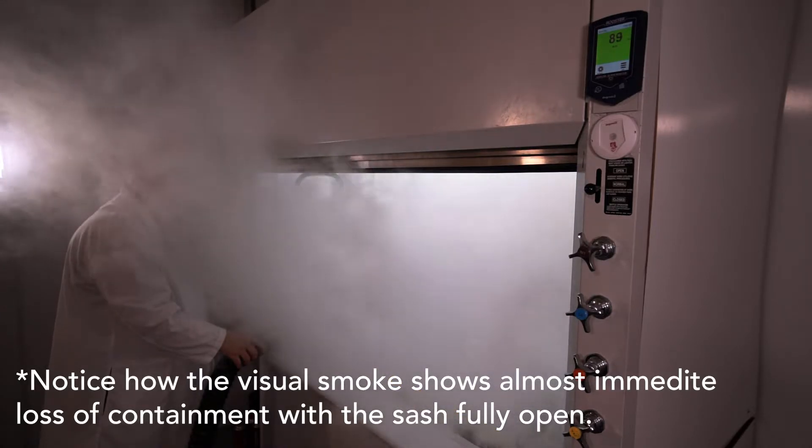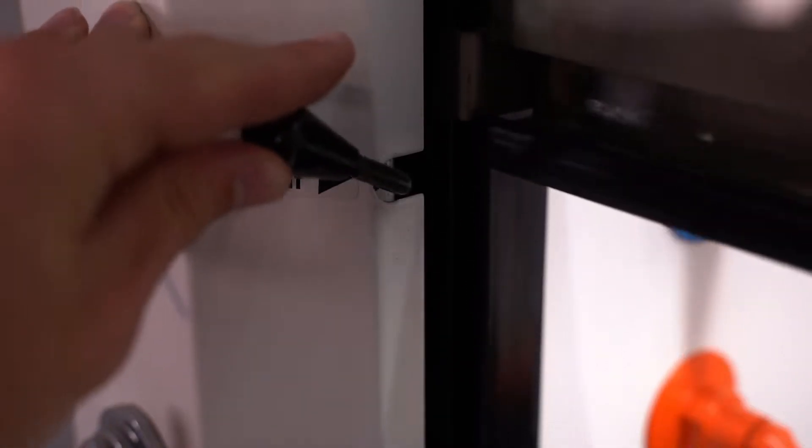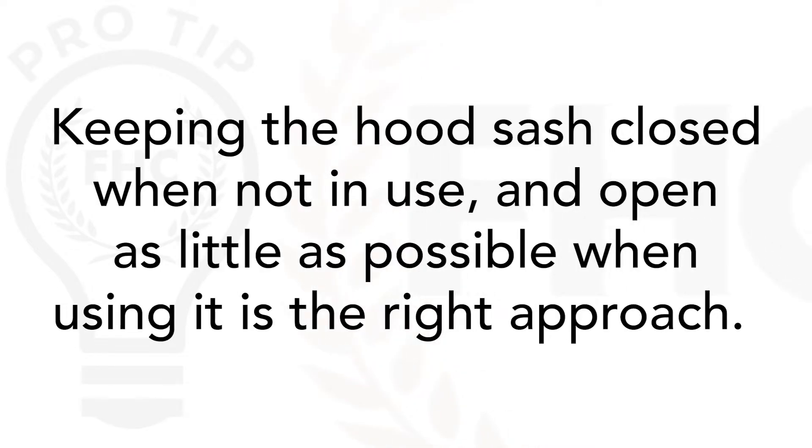Lowering the sash is better. Sash movement should be easy — many sashes can be operated with one hand from any position along the sash handle, and many newer hoods have auto sashes that move with the assistance of a motor. Hood sashes are generally made from some type of safety glass, either tempered or laminated, to offer more protection and minimize the likelihood of the sash itself breaking and becoming part of an incident.